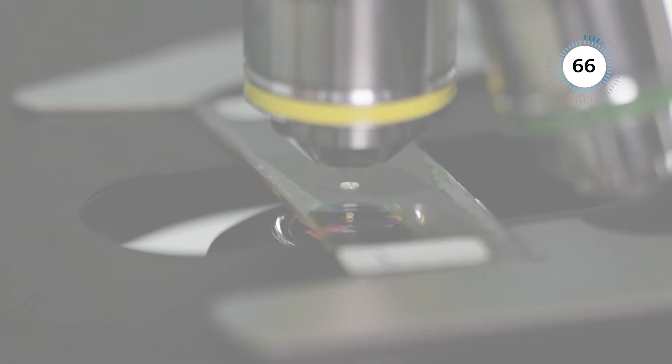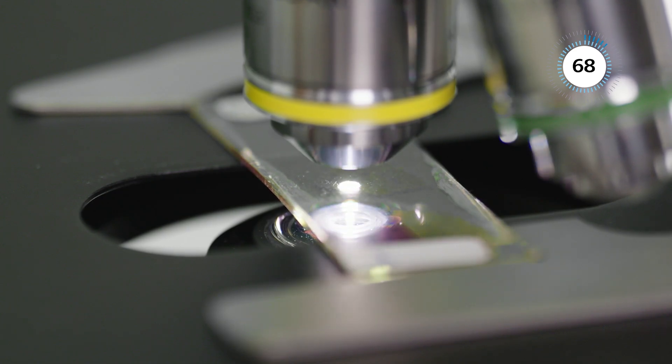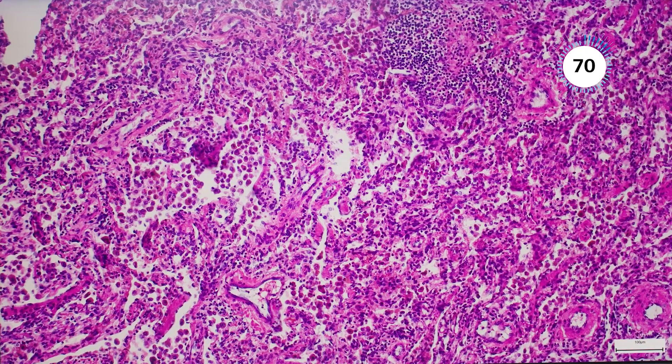With the 10W LED, you visualize and document your samples in natural colors, where even subtle color differences are clearly visible.